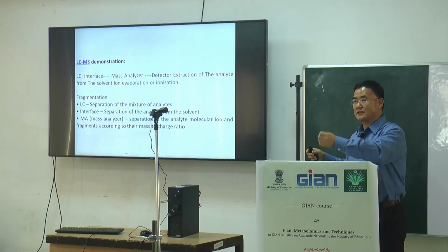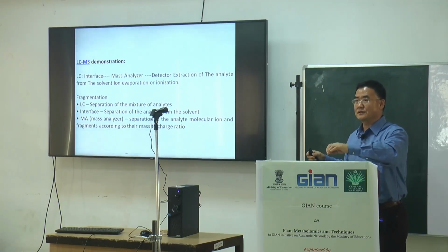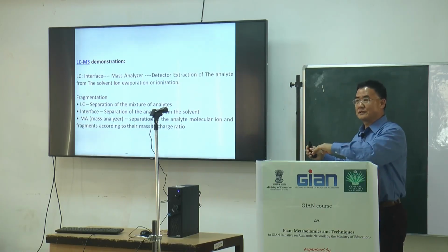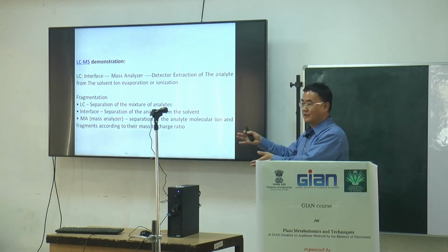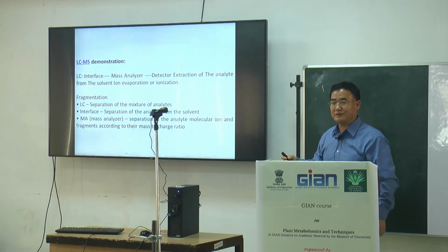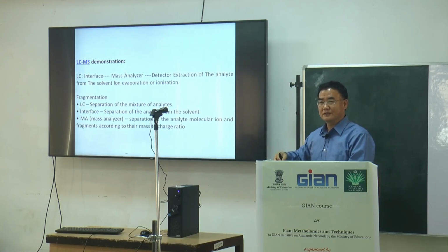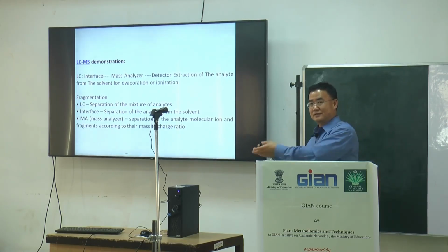Those particles or metabolites with different charge and also different molecular weight will be separated, very easily separated. And finally, if some metabolites in the middle start to drop and don't have enough speed, you have to use the field to continue charging and give more energy to accelerate the speed.